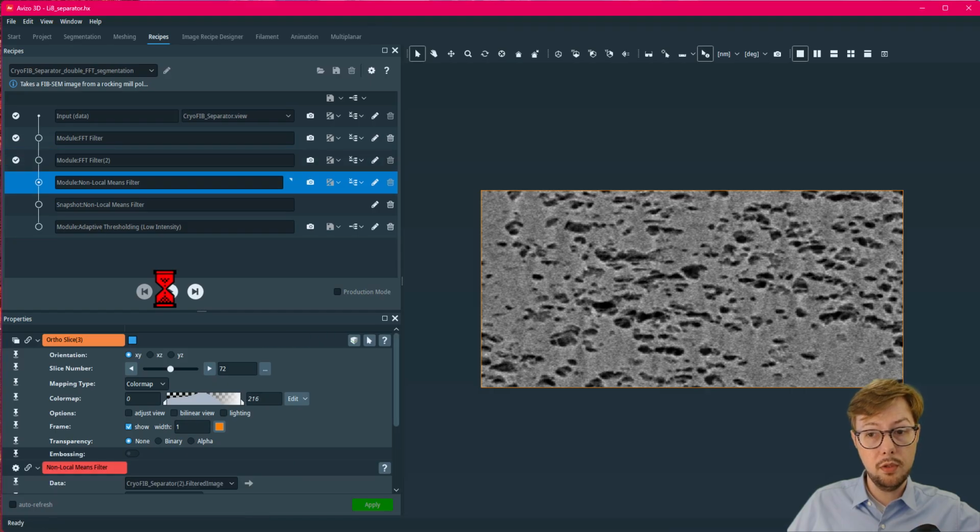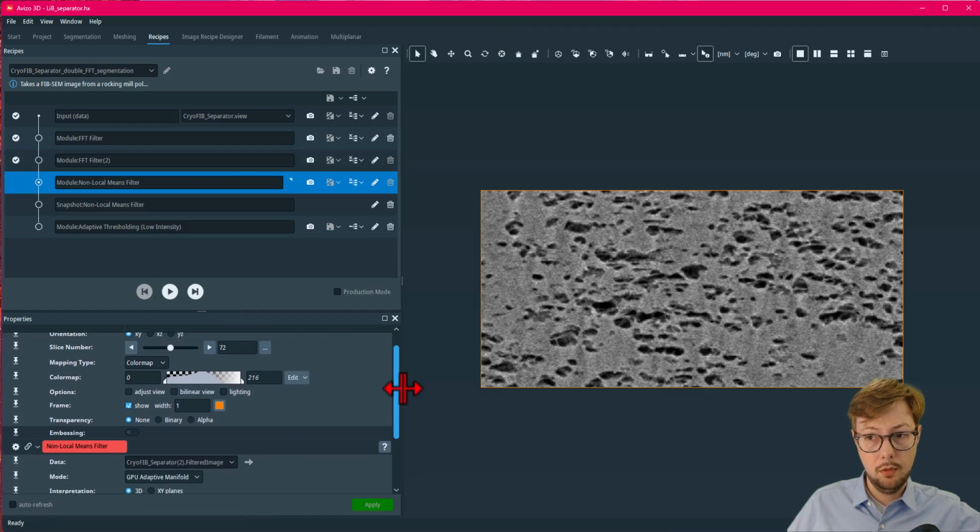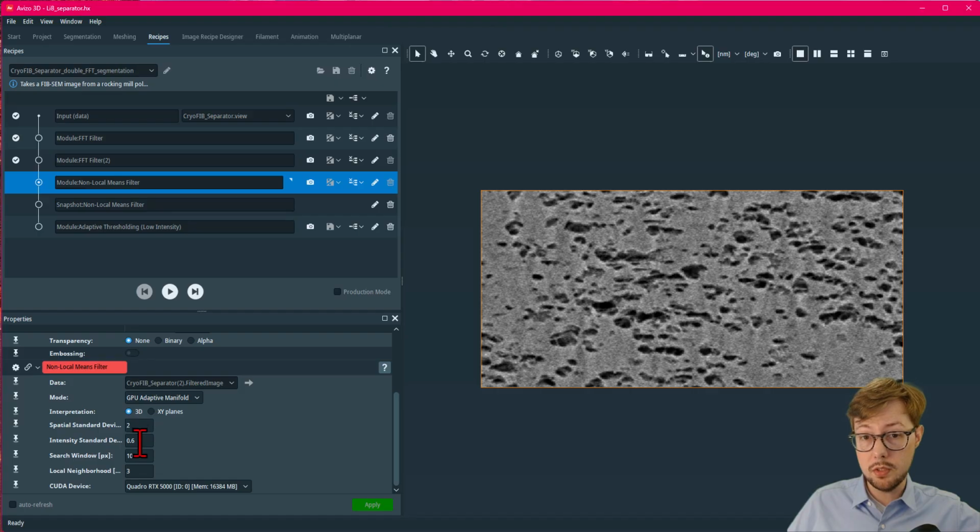Optionally, you can modify the parameters before continuing. This adds interactivity to a recipe, useful for handling data that are difficult to generalize settings for. It is also possible to skip a step. That can be useful if you have an optional setting that is not always applied.